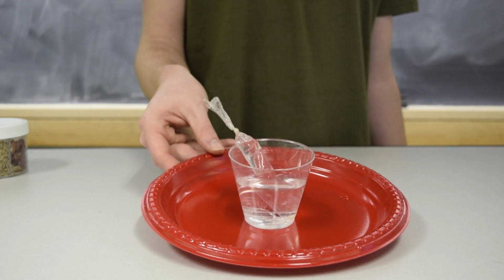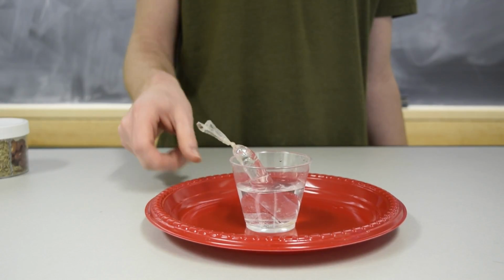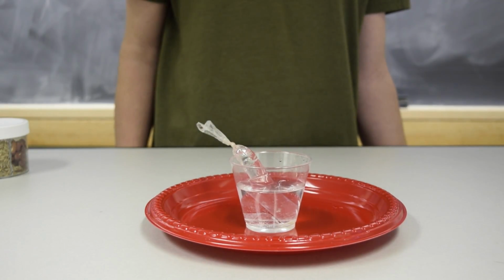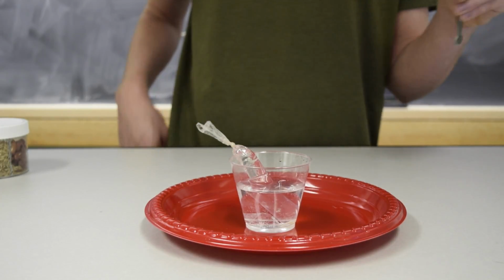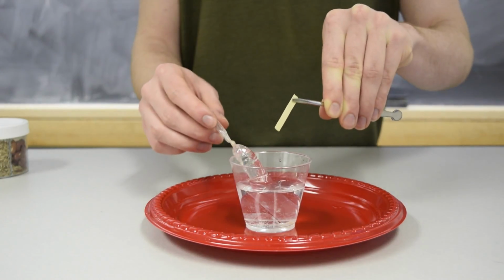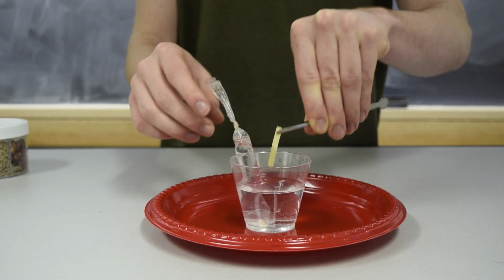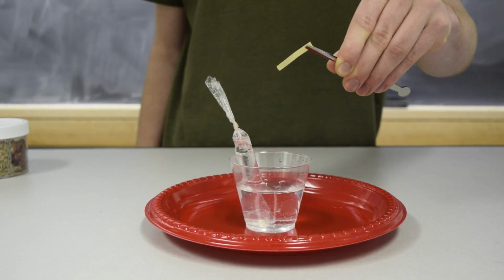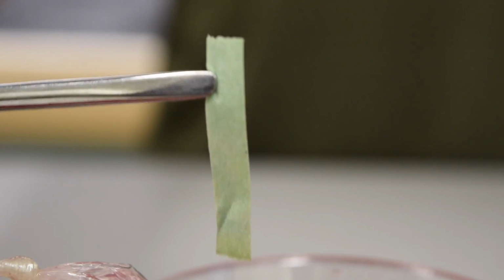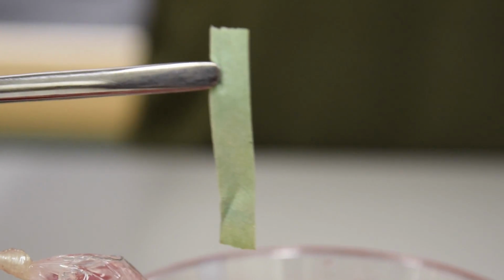Hand out this testing setup to each pair of students on the red plate. Be sure to warn students not to touch the materials. We'll begin by testing the solution outside the tubing for glucose using the same glucose test strips we used before. Remind students that if it turns yellow, there's no glucose, and if it turns green, that indicates a presence of glucose in the solution.